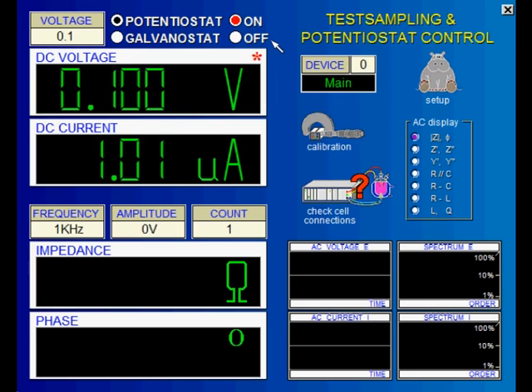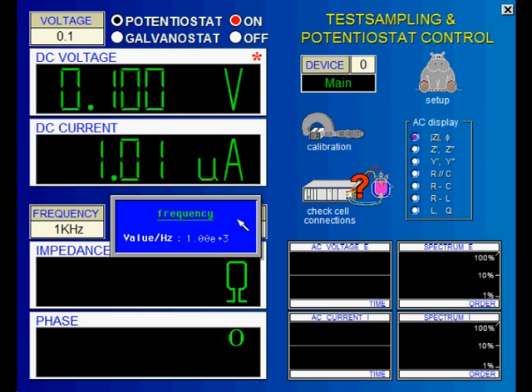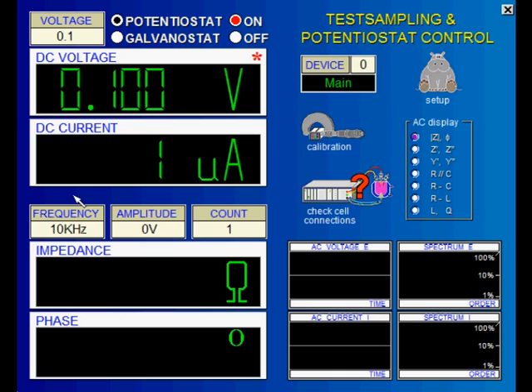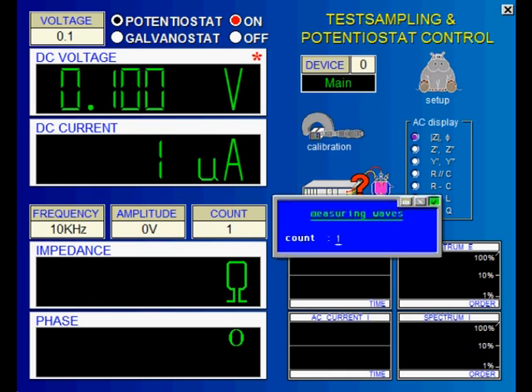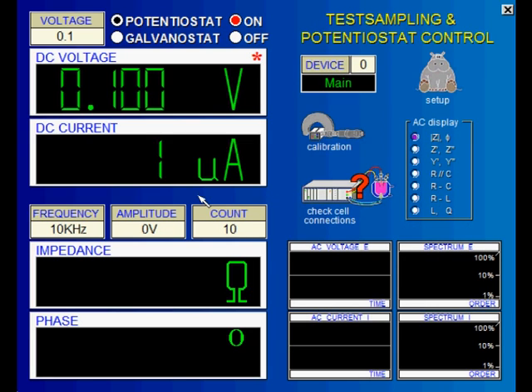We only used DC voltages and currents so far. In order to record EIS, we need to superimpose an AC amplitude. You can set the frequency of the AC sine wave here. This frequency is only used in the control potentiostat page and does not have any meaning in the EIS measurement later on. The same is true for the number of shots per measurement point — this averaging will smooth noisy signals.